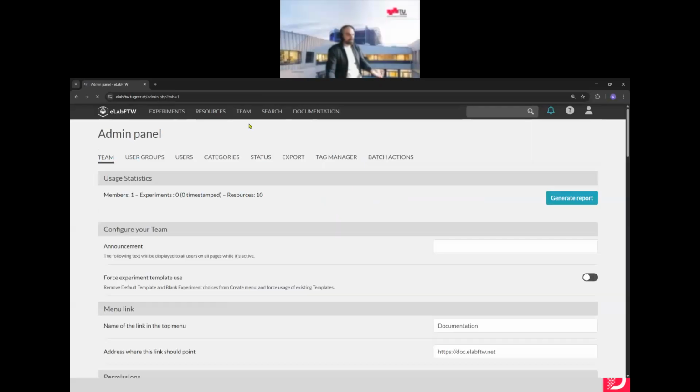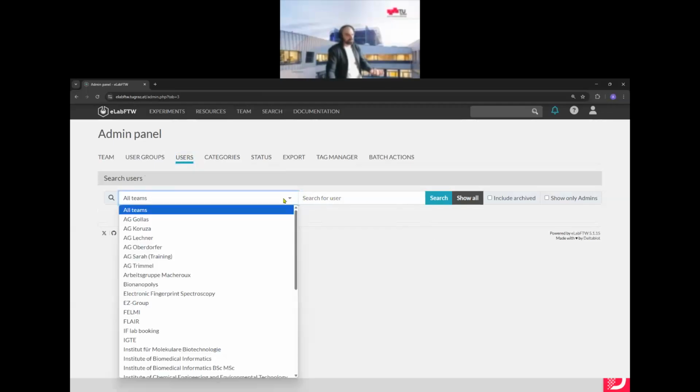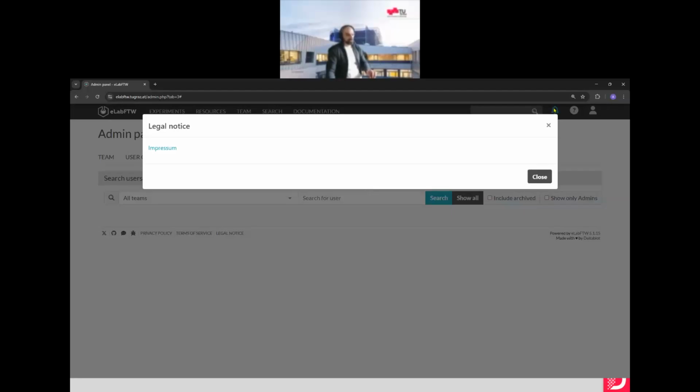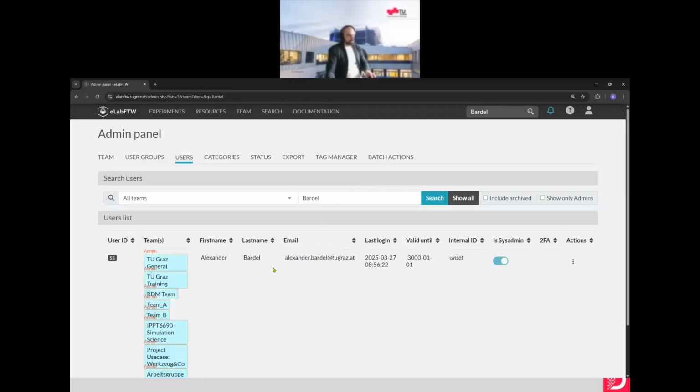let's go back to the admin, also add new users to my team. I could search for users, or search for new team members in the instance. So I can go to all of the teams that I have available, and I want to include someone new in my team. And now I want to include him in my team.